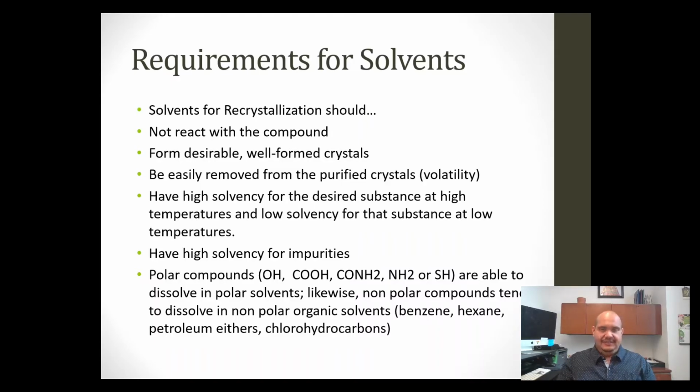How is it gonna crystallize at room temperature if your solute is so soluble in your solvent that it dissolves at room temperature? Remember, at the end of this experiment, which I'll show you, your solute should not dissolve in your solvent at room temperature, only at boiling.